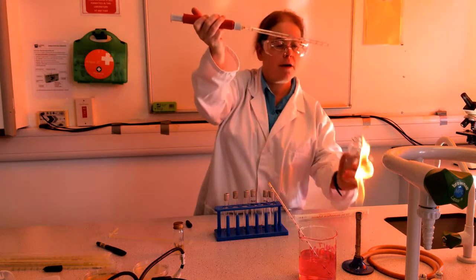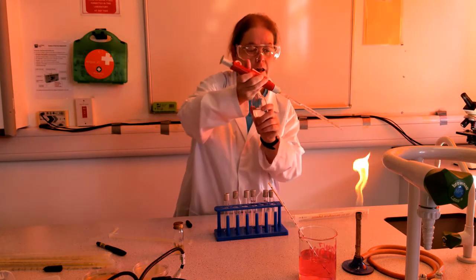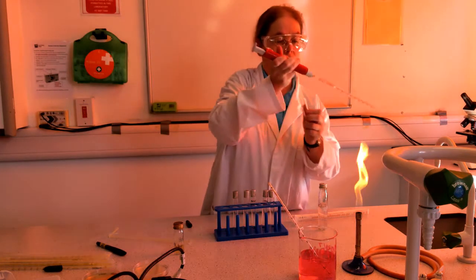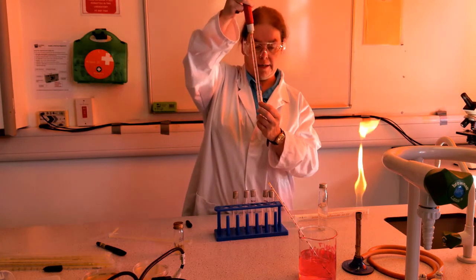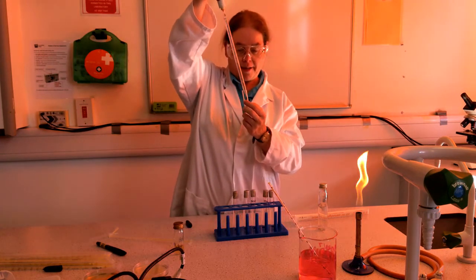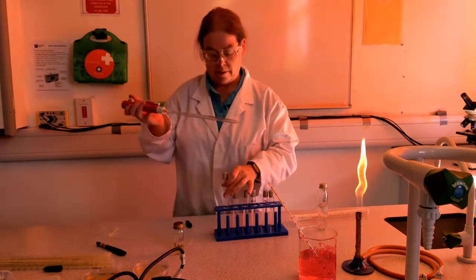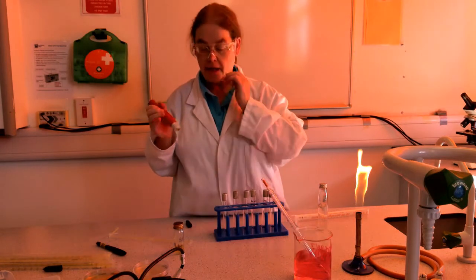There we go. And put it in our sterile tube. Like so. Not the way it wants. Right. This isn't particularly contaminated, but I'll just put it there for now.